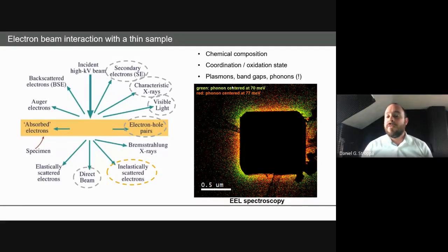And this is a very recent possibility. The first report of such kind is from 2015, and this technology is just now available in a more commercial aspect. So still, there is much in terms of evolution of EELS spectroscopy and TEM microscopy overall.